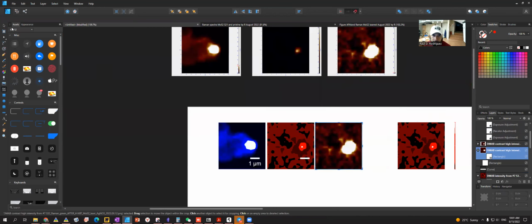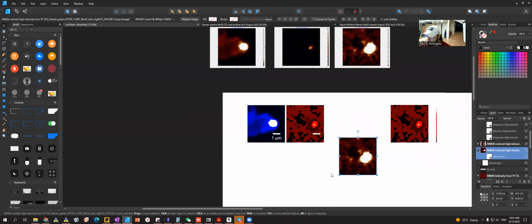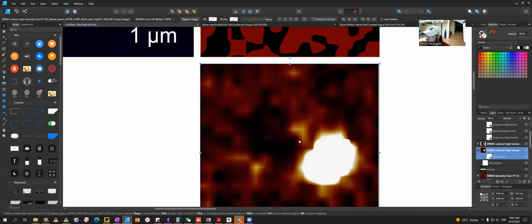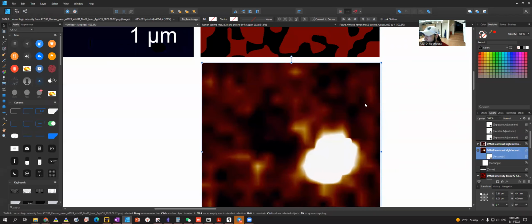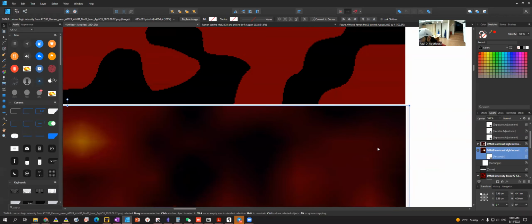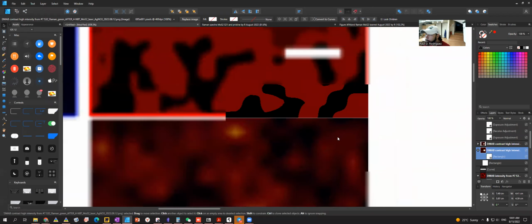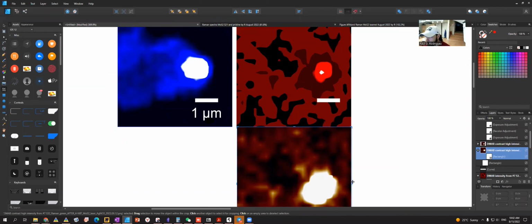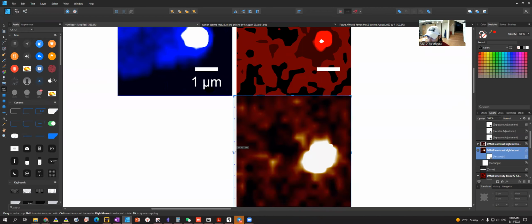It's better if you do this once for all the figures at the same time. So for example, here you see this is also not very good. You have this size here that you don't have there. So I will, yes, there. Then let me move it until it's not there.